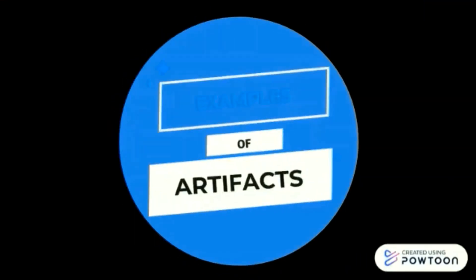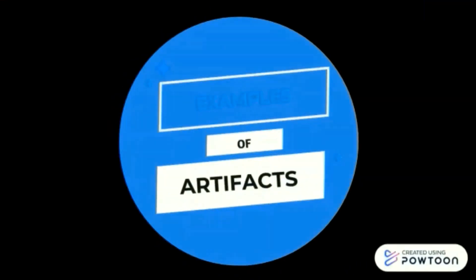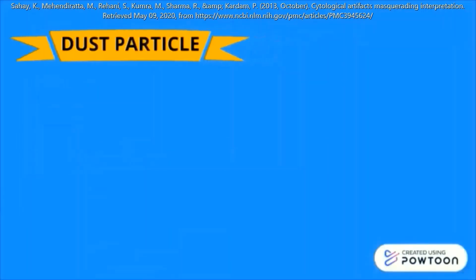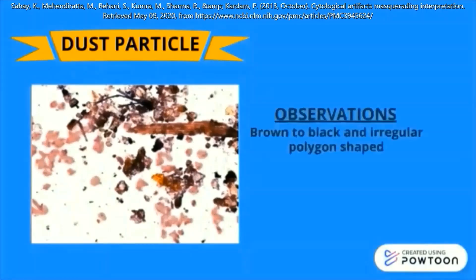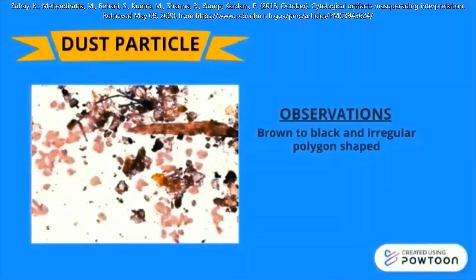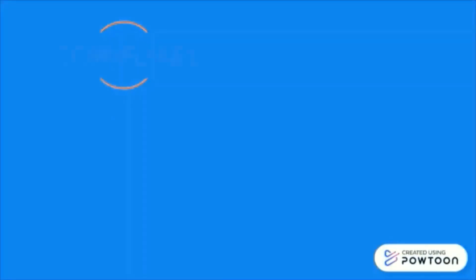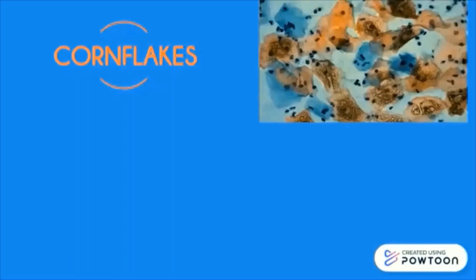Now let us take a look at a few common artifacts. The first artifact is dust particle. Dust particles are brown to black in color and have an irregular polygon shape. The second artifact is cornflakes.